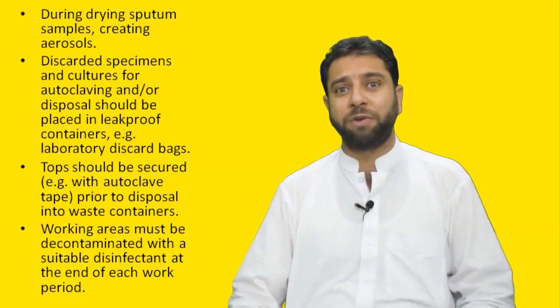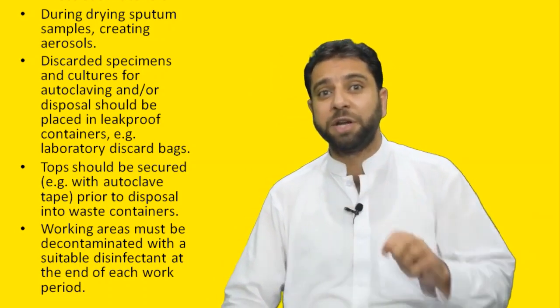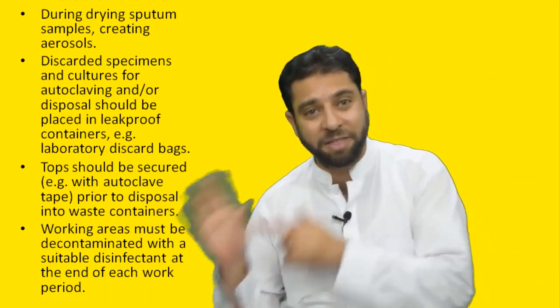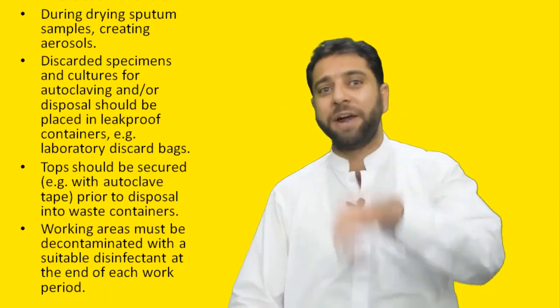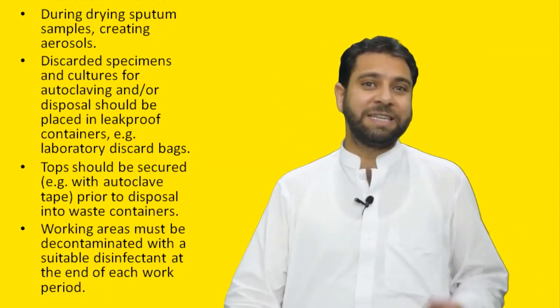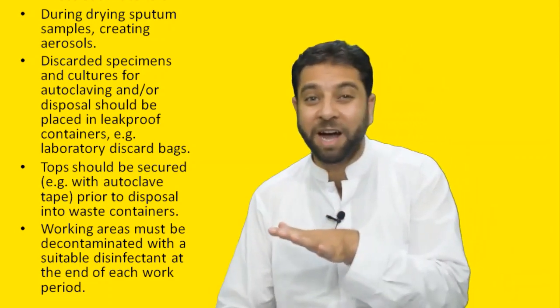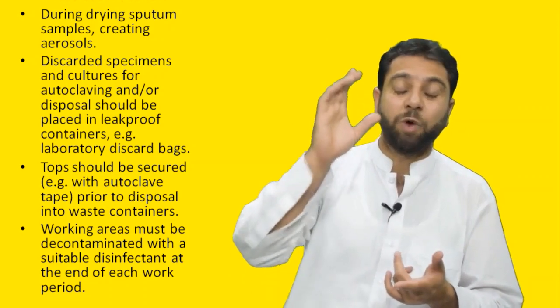Then they should be autoclaved, and after autoclaving, those discarded materials should be disposed of into waste containers. The most important thing in avoiding the dispersal of infectious materials is the decontamination of the working area with a suitable disinfectant at the end of each work period.